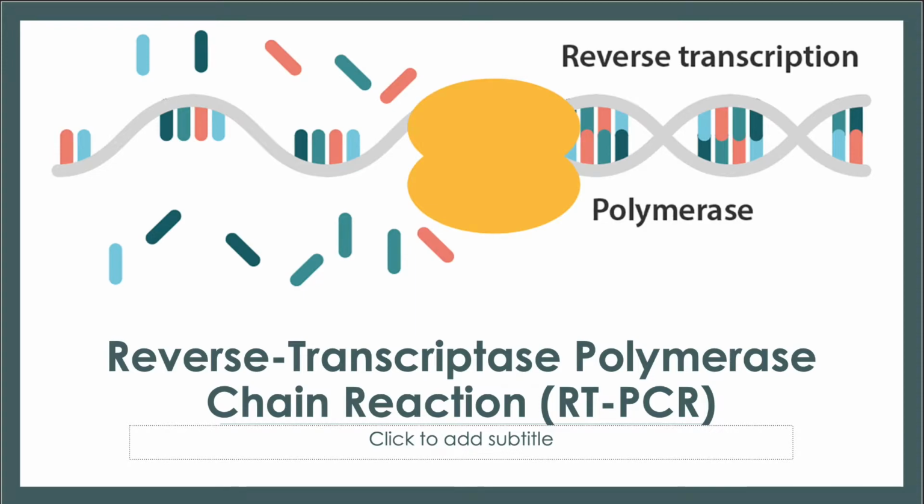We're going to discuss the reverse transcriptase polymerase chain reaction, popularly known as RT-PCR. This is the second part of our lecture about amplification techniques. Initially, we discussed PCR and now RT-PCR. Today, we're going to learn the difference between the two, the function of RT-PCR, and the current uses in our clinical diagnostic environment. Okay, so let's proceed.